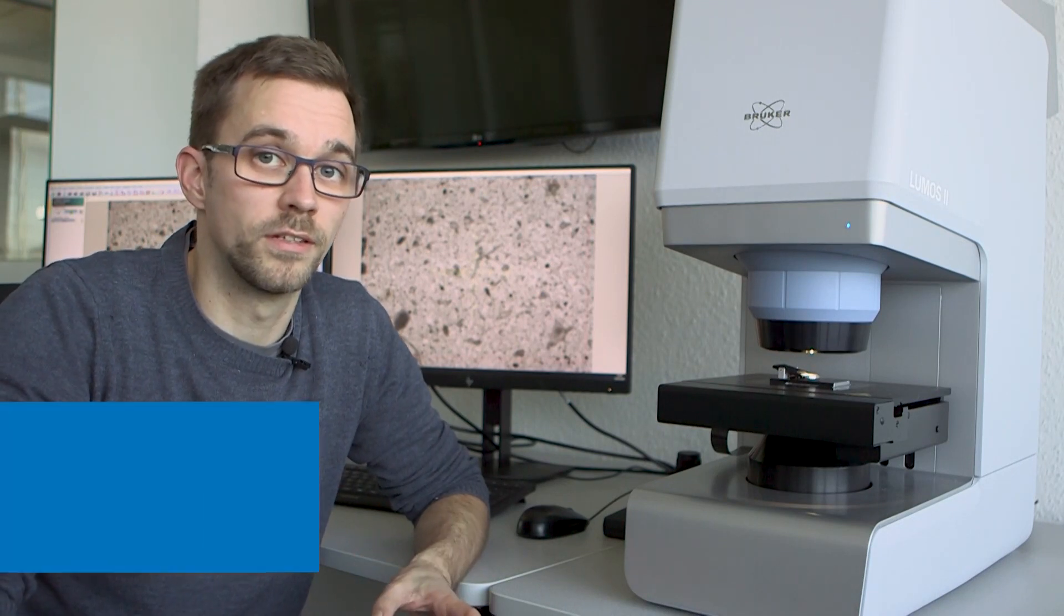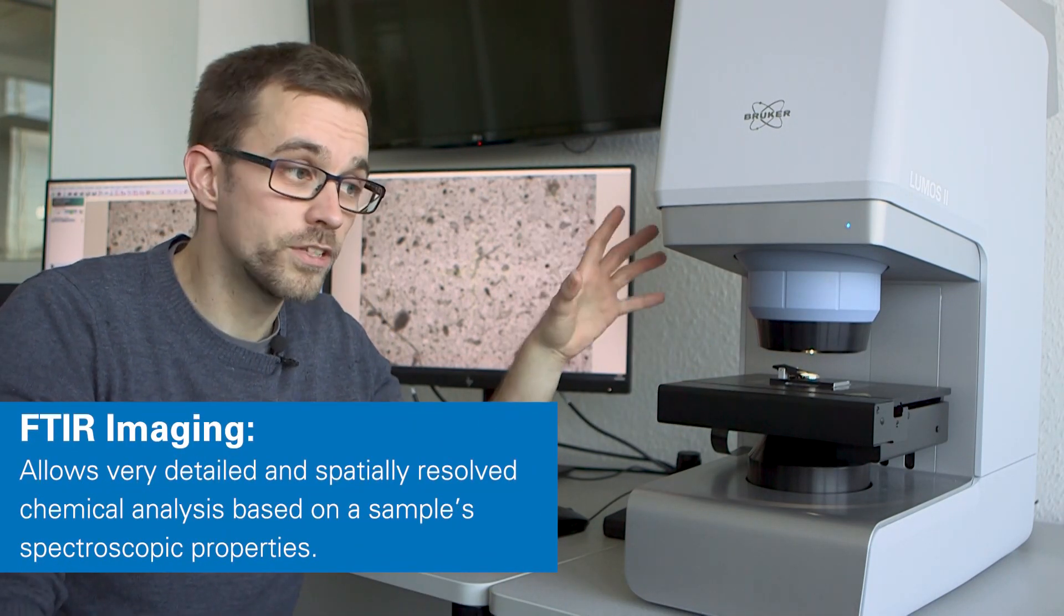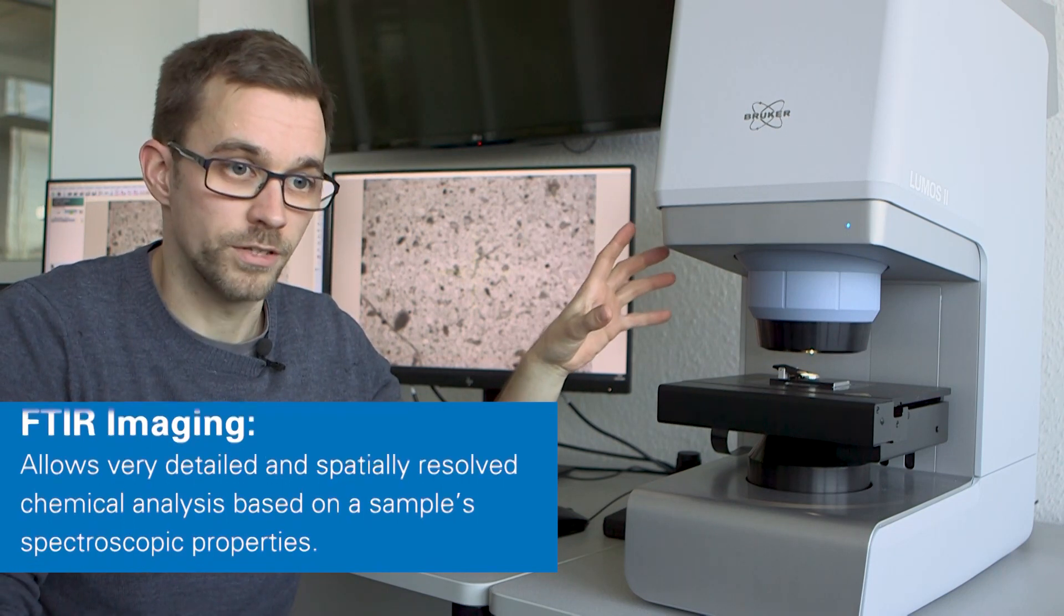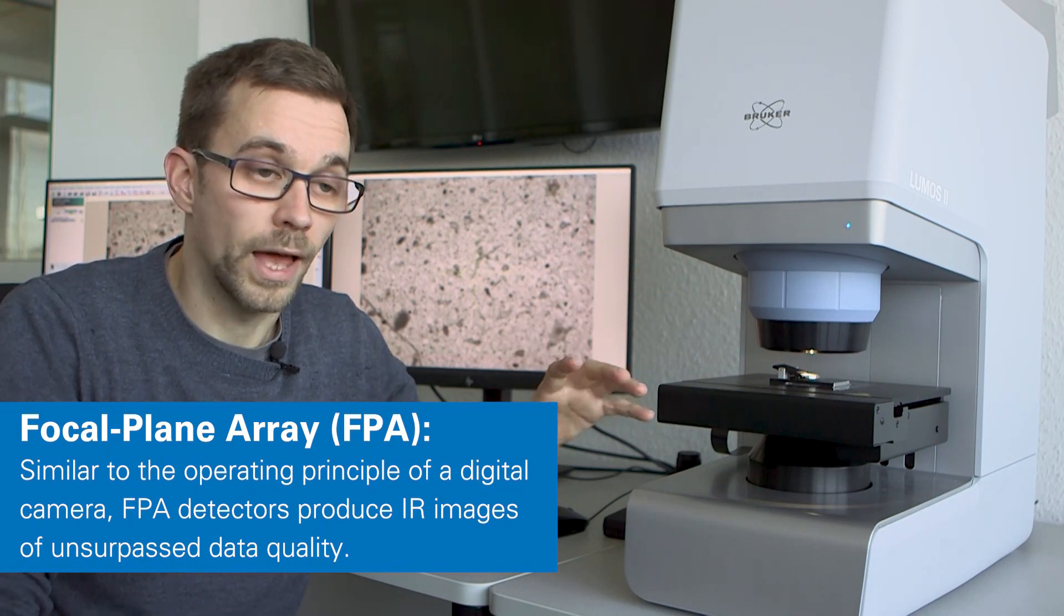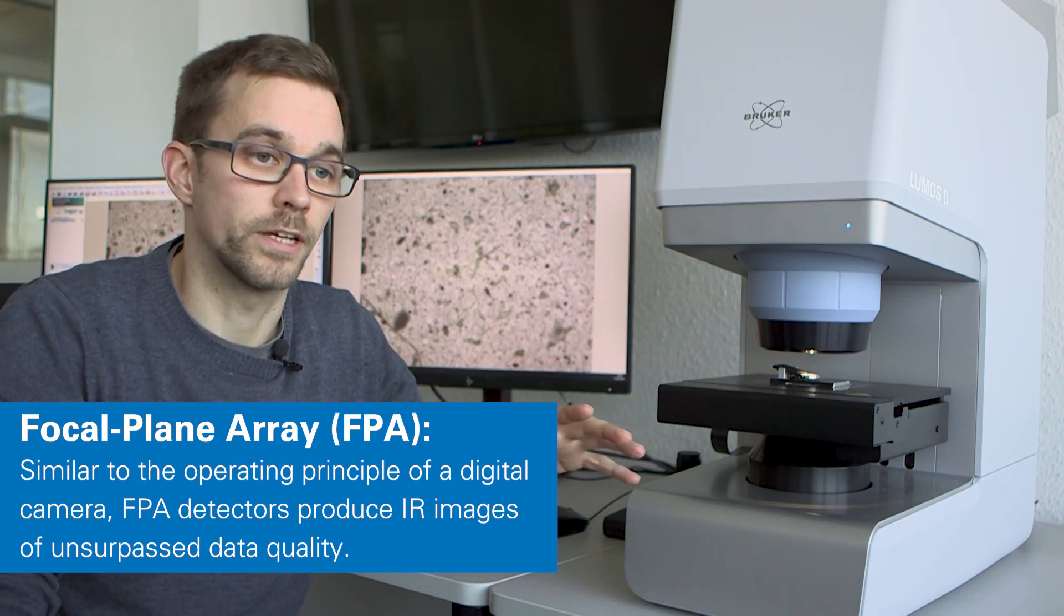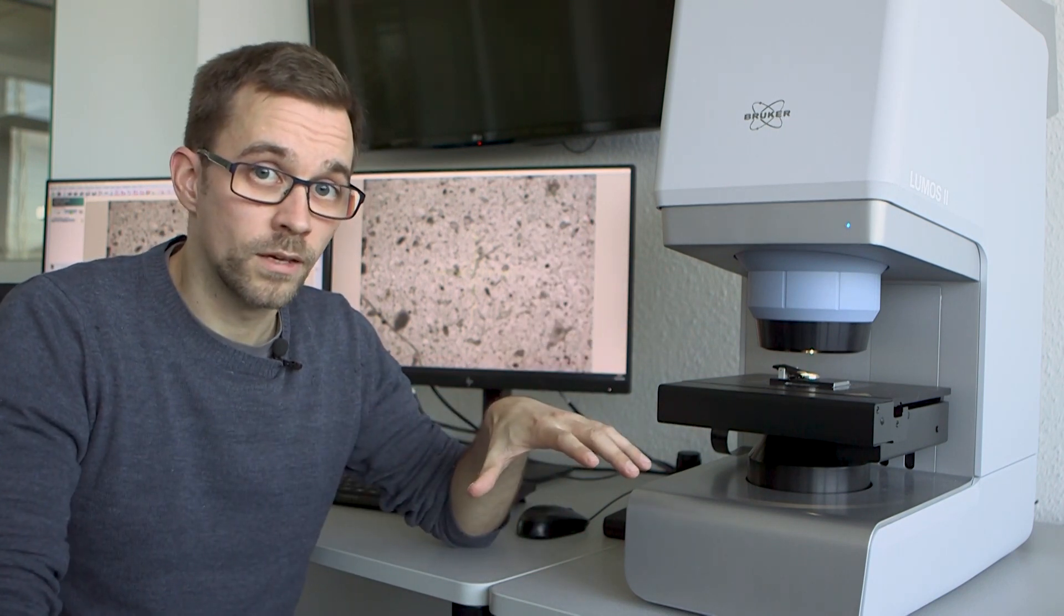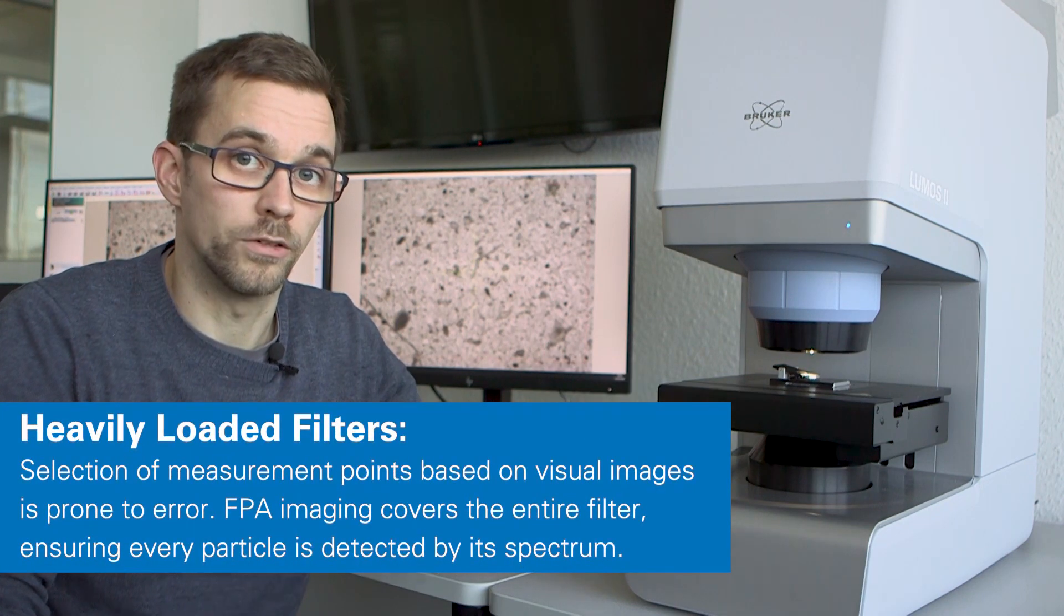We are ready for our imaging measurement. We already placed the sample on the stage of the Lumos II FTIR imaging microscope and we're going to use its focal plane array detector for the measurement. This way we have a far better spatial resolution and measurement speed than any line array detector could offer. We're going to measure the whole sample and this technique is especially suited for samples with a high load of particles.